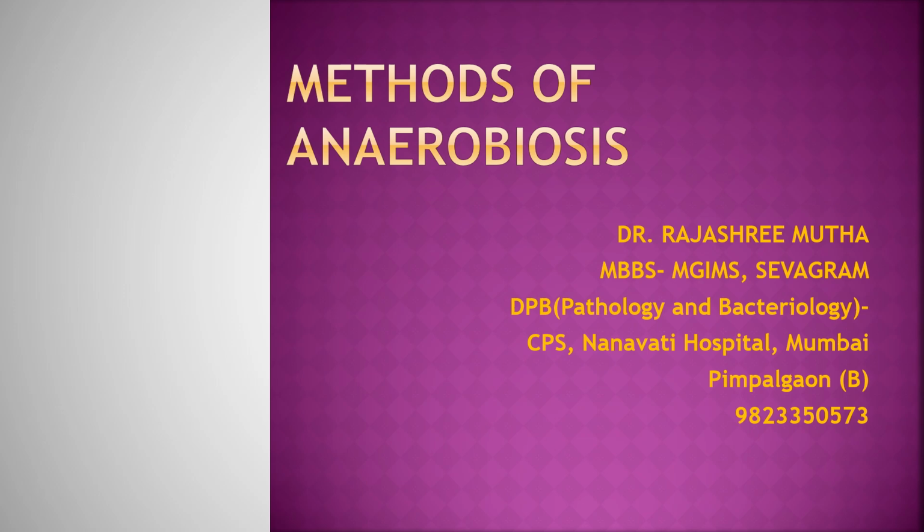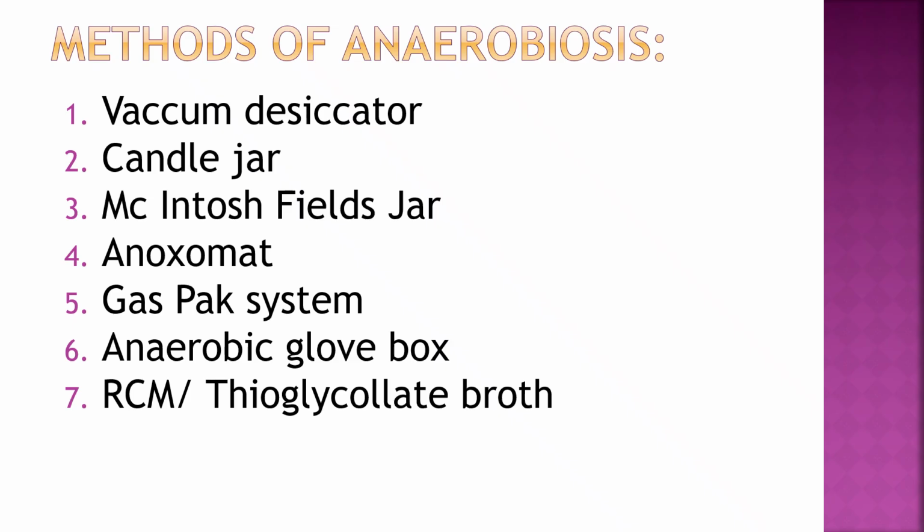So let's study methods of anaerobiosis and non-sporing anaerobes. And first we will see methods of anaerobiosis. Anaerobes require an anaerobic environment, that is, an absence of oxygen. So there are a few methods, and they are called methods of anaerobiosis.